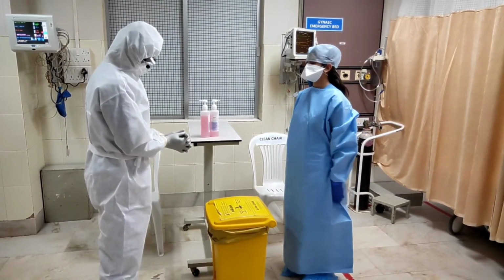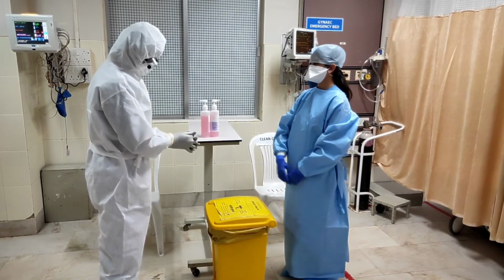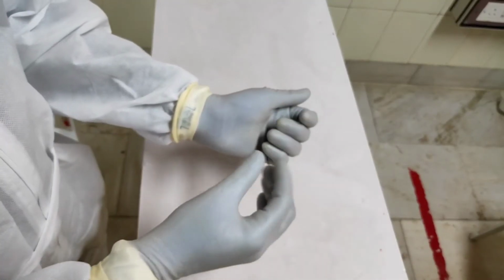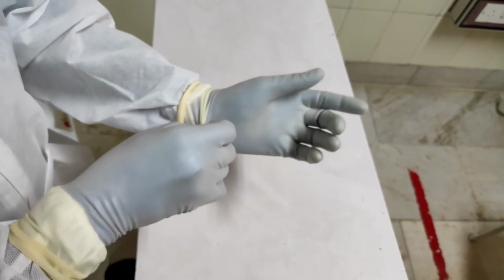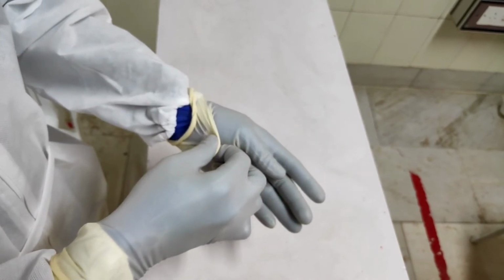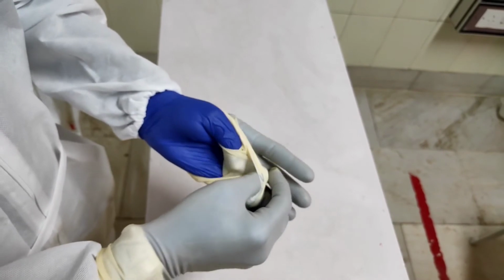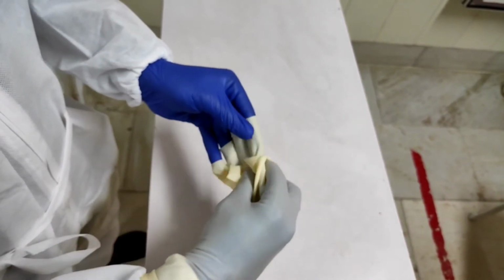Next thing to remove will be the outer gloves. When discarding the gloves, the first thing to make sure is that you get a good pinch on the anterior aspect of the gloves and slowly pull it off your hand. Do not pull very hard because the gloves can snap out and spill the contents as an aerosol.